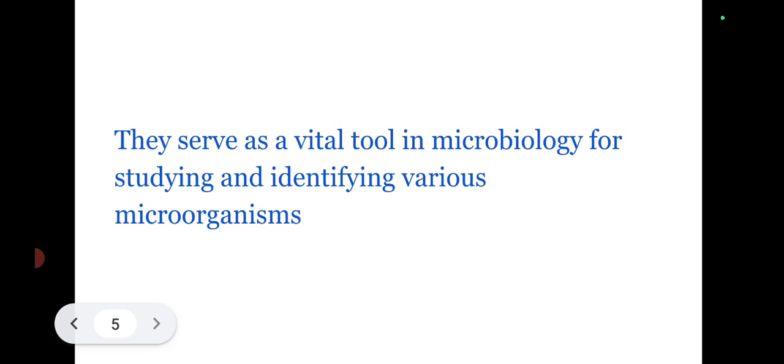So in short, the media helps in isolation of cultures, cultivation of microorganisms, identification of microorganisms, and in diagnosis or medicine also.